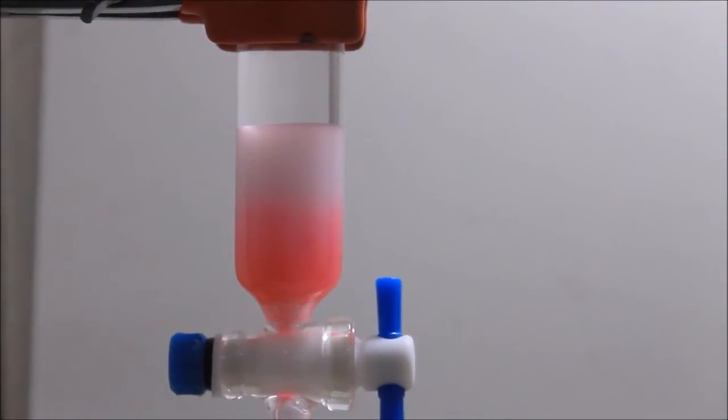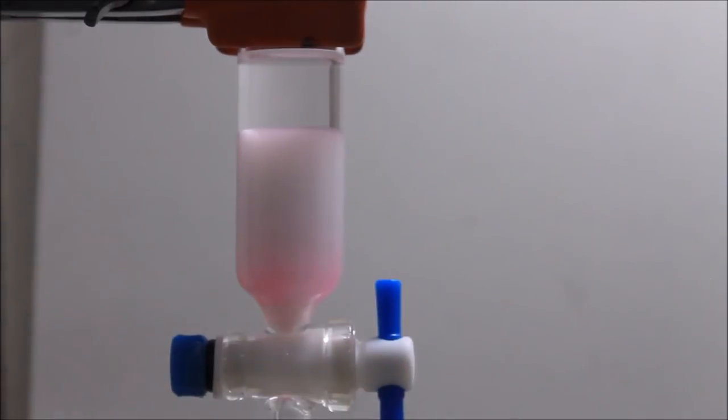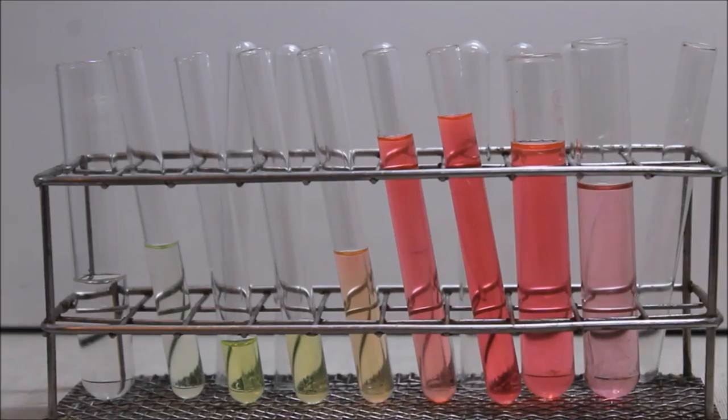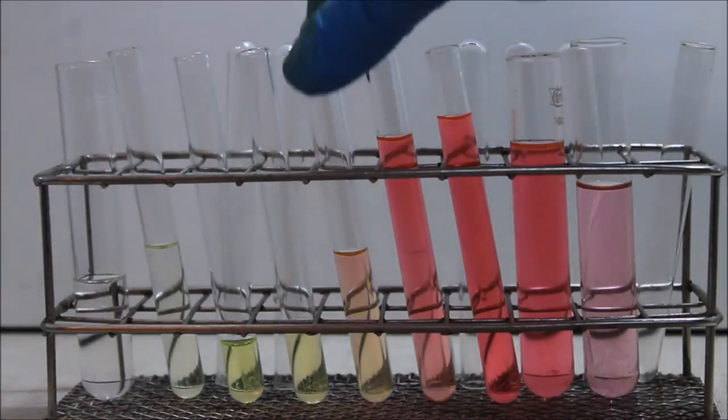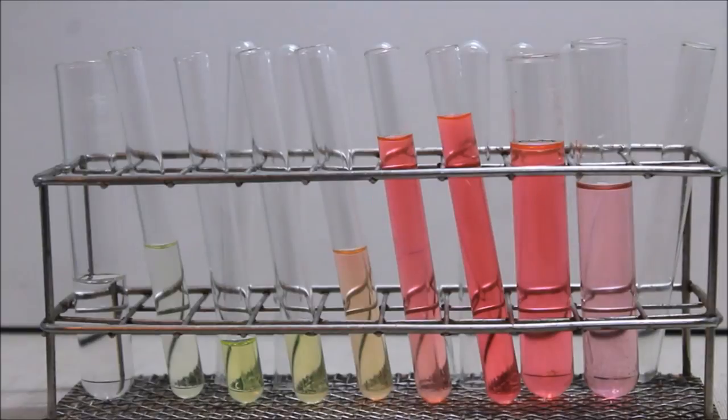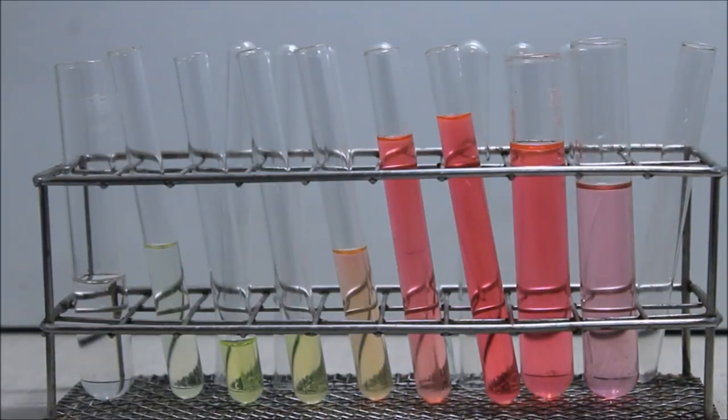Here you have a time lapse on how the safranin is eluted out from the column. Once the safranin was completely eluted out from the column, the stopcock was closed. You can clearly see that we have successfully separated the two organic dyes. Let's see it under the UV light.